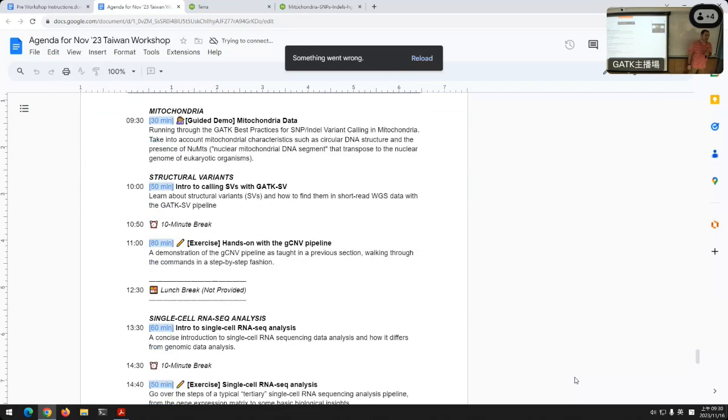Just as an introduction for today, there is a lot of new content just for you. Today is the first time we've ever presented the structural variation modules. We're going to do single cell. Actually, this is the second time for single cell, so we have a little bit of practice, but there's a lot of new hands-on exercises that we've developed and designed just for you. So be patient with us, bear with us a little bit, but we're excited to teach you some very new things today. You'll learn about mitochondria, structural variation, and single cell in the main part today.